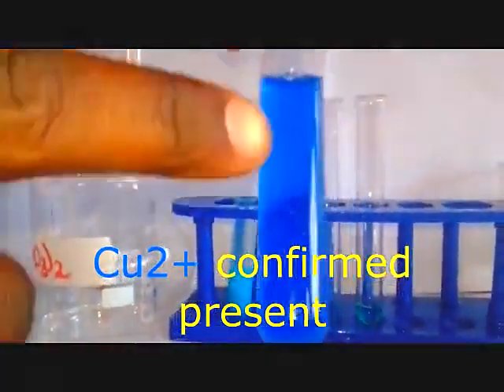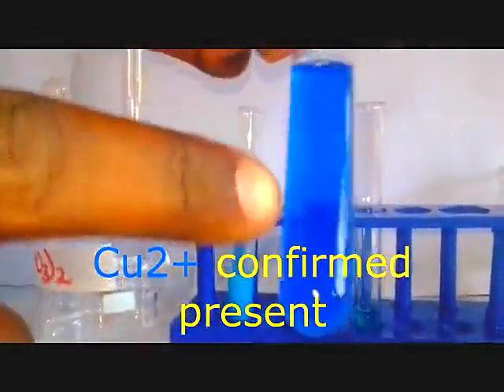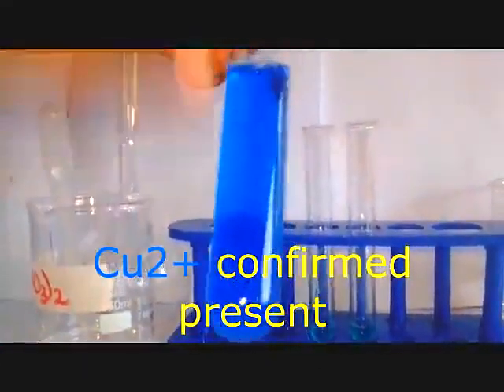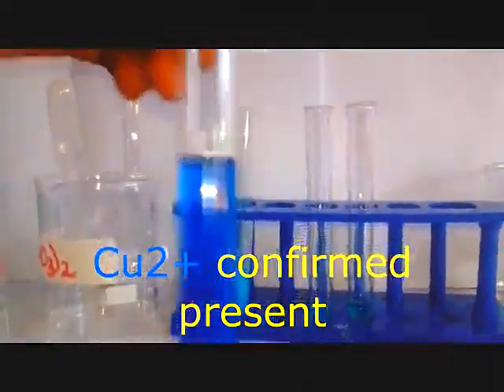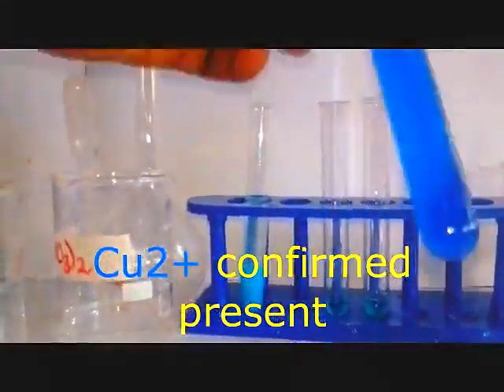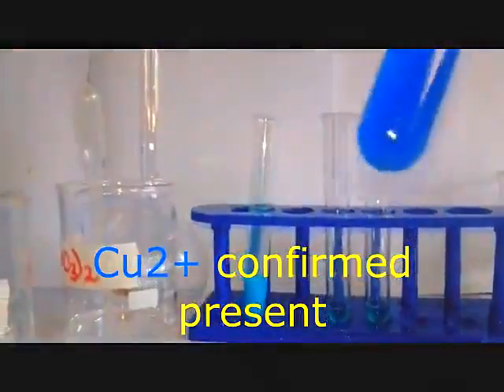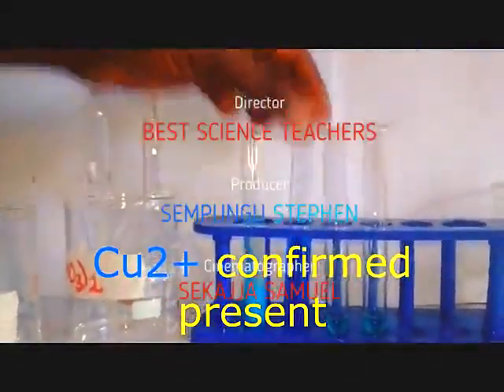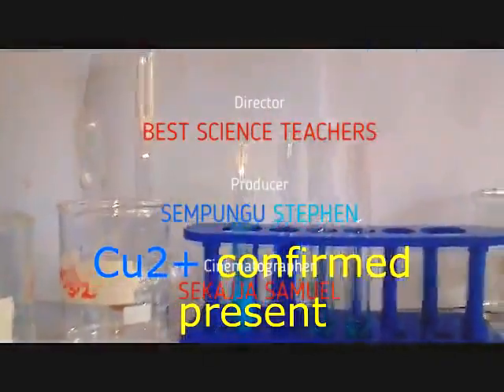So the first PPT is due to formation of copper 2 hydroxide. And copper 2 hydroxide can dissolve in excess ammonia to form a soluble complex. At this step we can confirm copper 2 ions. So you can write and say copper 2 ions confirmed present.